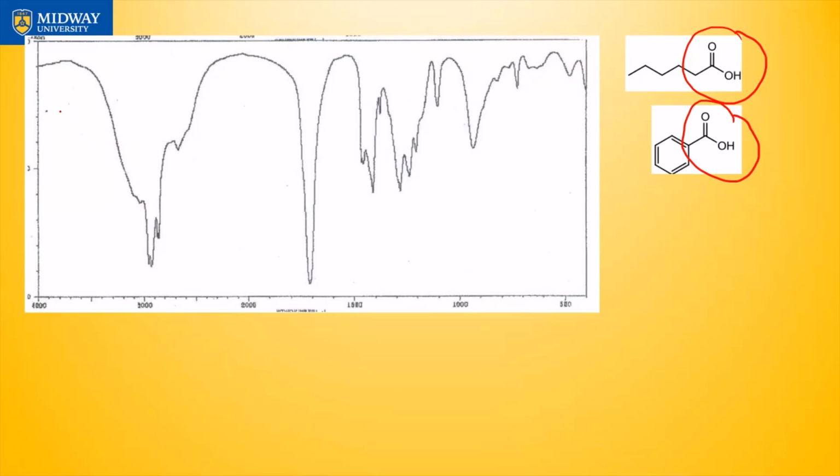They both have acid. Well, I'm happy with this. This is acid. Still doesn't give away which one is which. Well, this is the C double bond O spectrum. As I said, this single sharp peak is C double bond O. Well, that's in both either. So this is acid. This is the OH in the acid. And this is the C double bond O, which is around 1700. This is around 3100, something like that, or sorry, 2500, something like a giant peak.